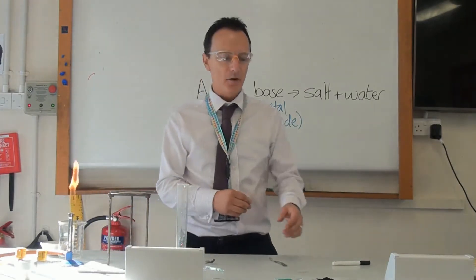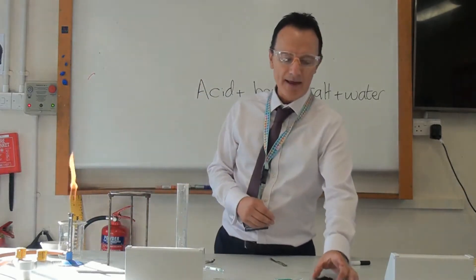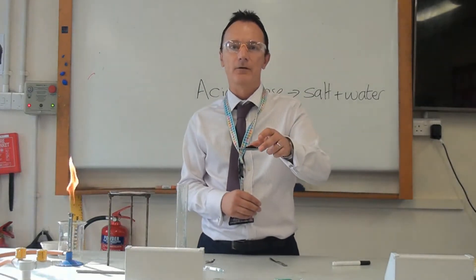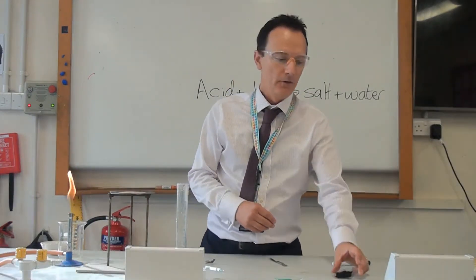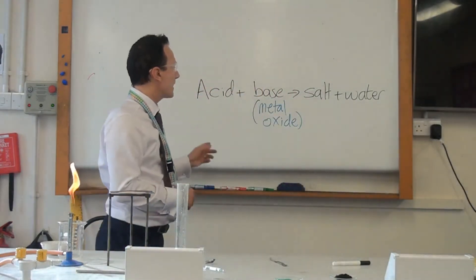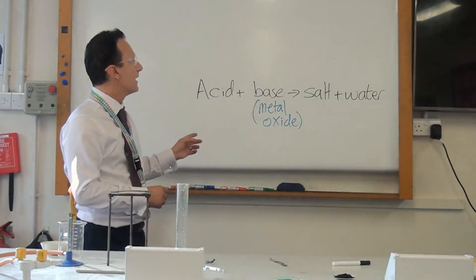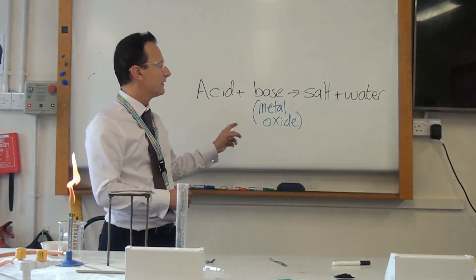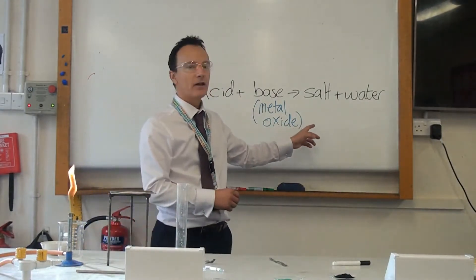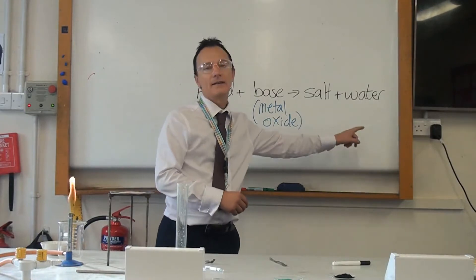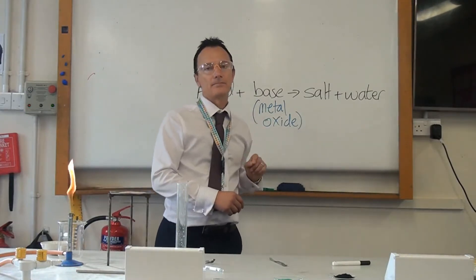The base that we are using today is copper oxide powder. So we are using copper oxide and hydrochloric acid to make copper chloride and water.